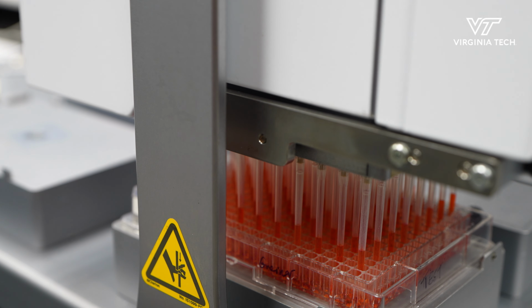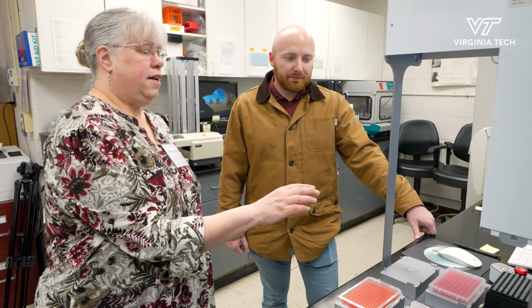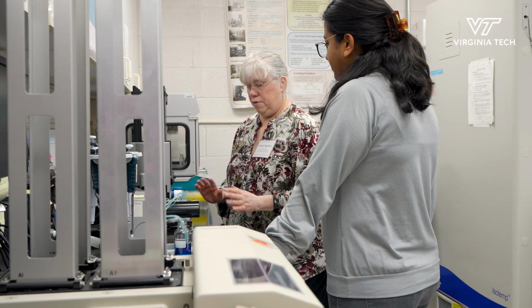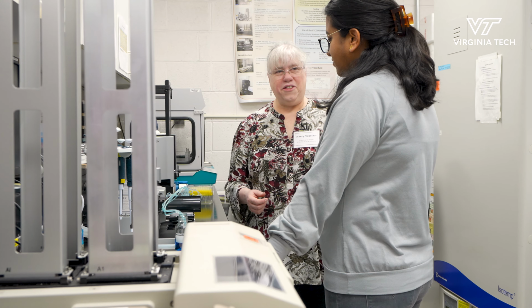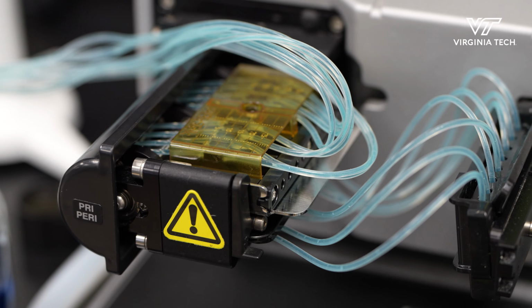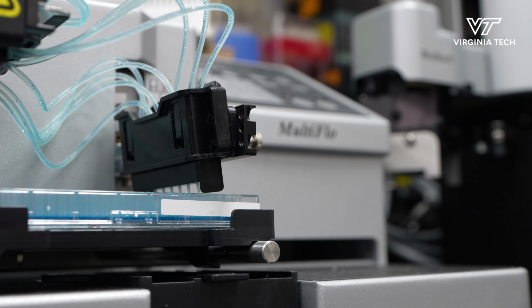Yeah, the open house is a great opportunity for people to come and see what we're about. So what we do at the screening lab is we work with investigators at Virginia Tech to help them execute high throughput screening. To give you an example of how the screening center might be used, my laboratory has a project in which we're going to screen several thousand compounds for anti-malarial activity.